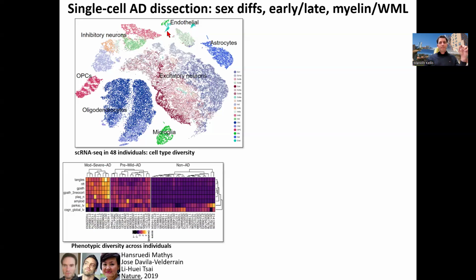After you've done that, you basically have this expression matrix that I showed you in the last lecture. You basically have a matrix of a lot of genes and a lot of cells. Everybody with me here? The next step after that is to cluster these cells together to basically figure out what are distinct cell types, if you wish. And this can be kind of challenging.